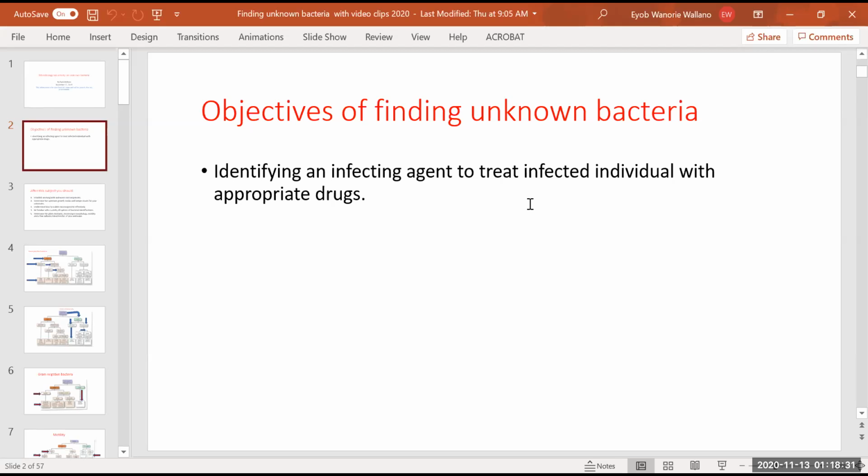Why the fermentative process? Because the work you have done on the three stains, gram, spore, and acid-fast, you need to accompany it to make it proof, to make it perfect so that the analysis is exact enough to prescribe medication for a patient.